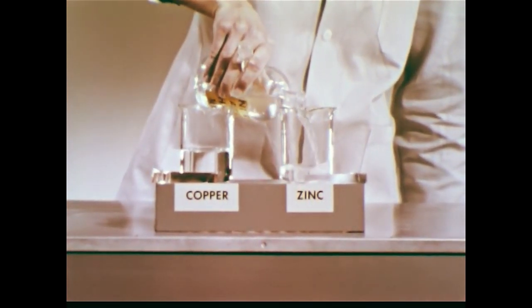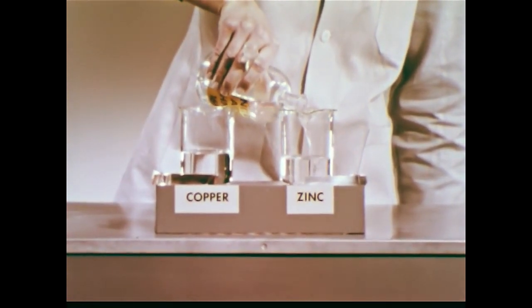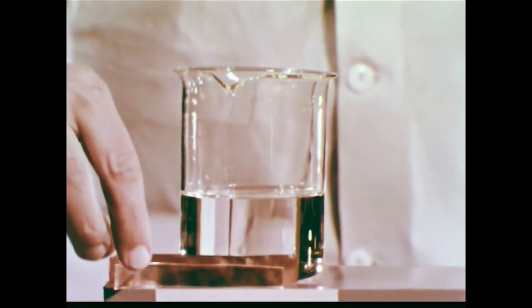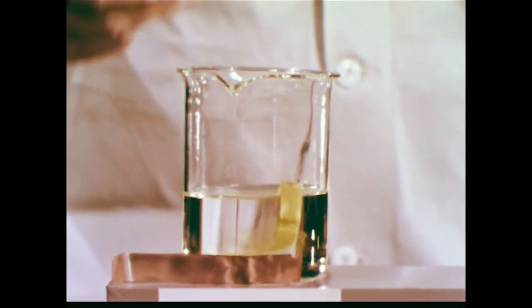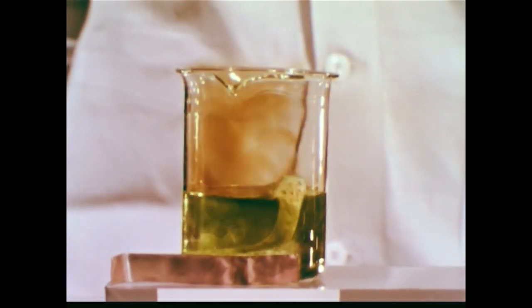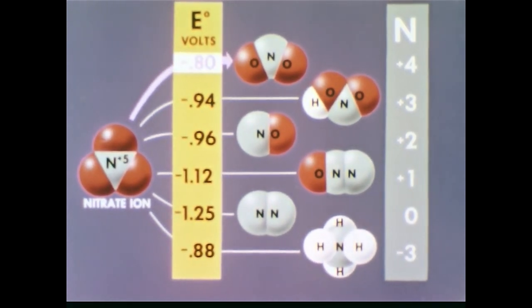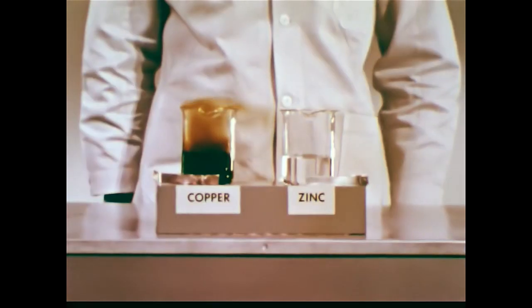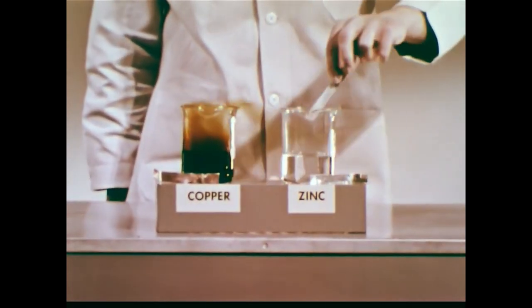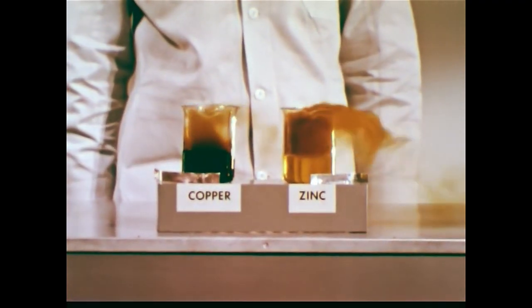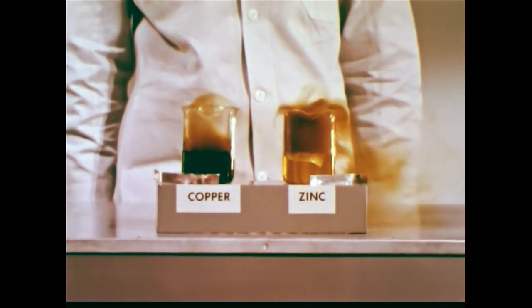Now let's try a couple of reactions with concentrated nitric acid to see what products we do get. If we add the reducing agent copper to nitric acid, we might expect to get colorless nitrogen gas — actually, we get brown NO2 gas, yet this reaction has the smallest E0 value. Suppose we use a stronger reducing agent, zinc. Again, brown NO2 gas is obtained, though this reaction is more vigorous. Instead of producing nitrogen, these reactions have produced the product with the smallest energy potential.